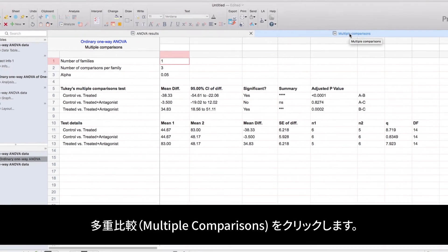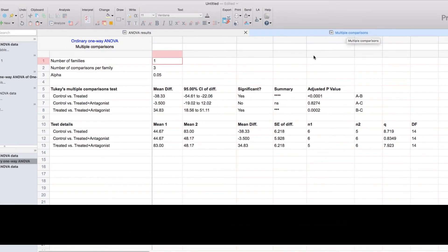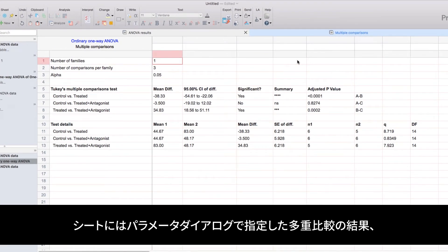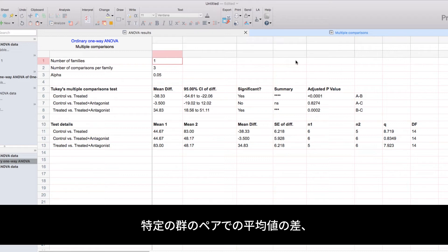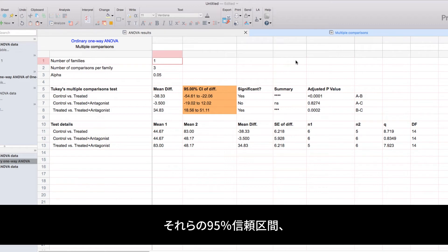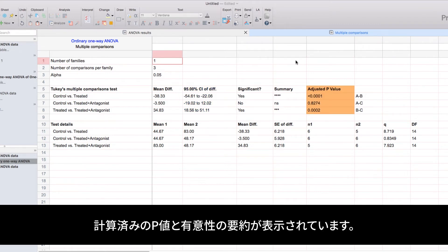When we click on the multiple comparisons tab, we'll be shown the results of the comparisons between specific pairs of groups that we identified in the parameters dialog, including the difference between their averages, the 95% confidence interval of that difference, the calculated p-value for the difference, as well as the summary of significance.